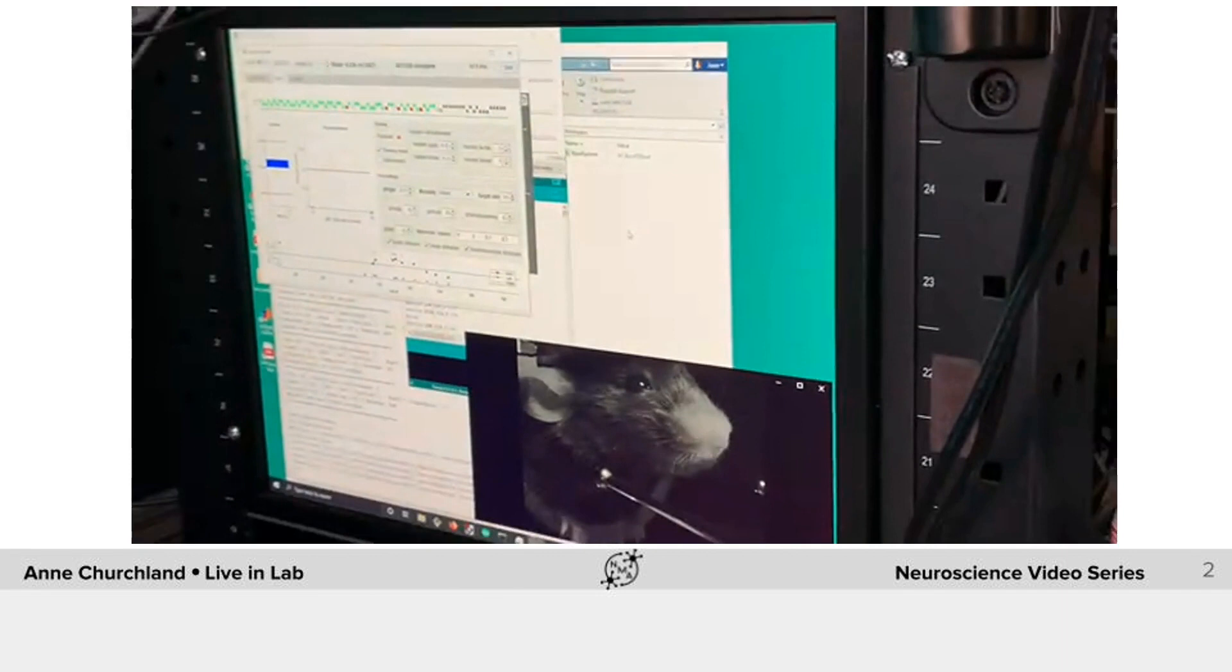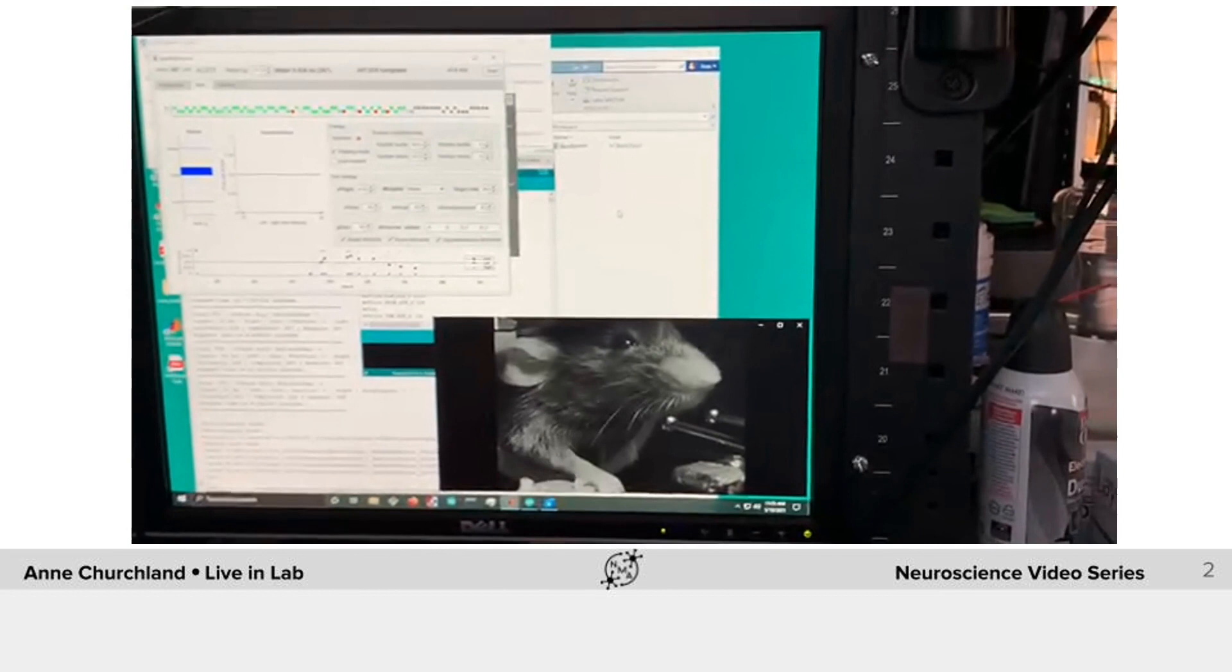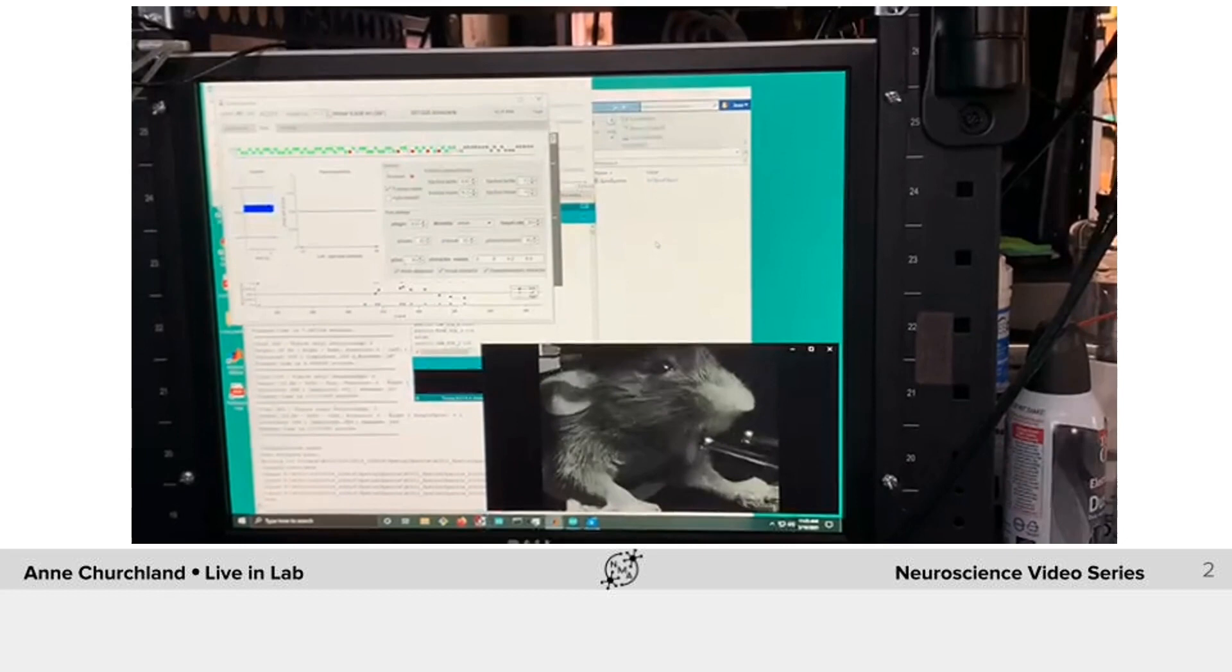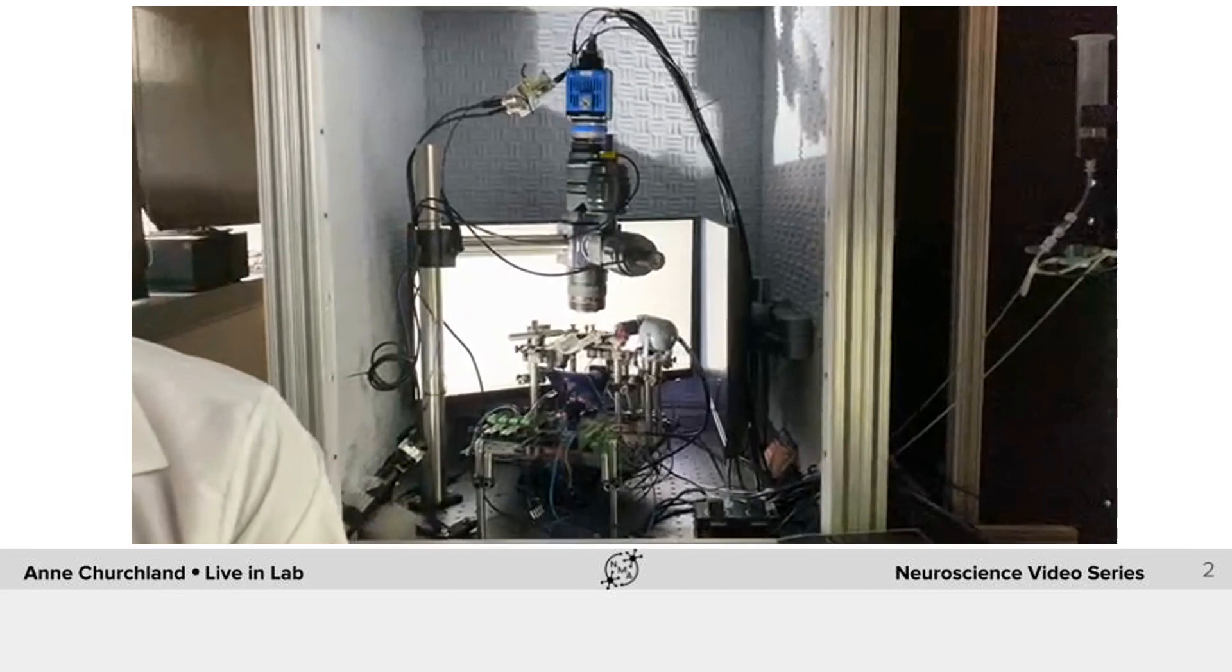As you can see right here we have the paradigm of the behavior working as well as a movie recording and this behavior is linked to another computer that is connected to the wide field imaging so allows us to record activity with the wide field during behavior. And here is Joelle to talk about the wide field setup.